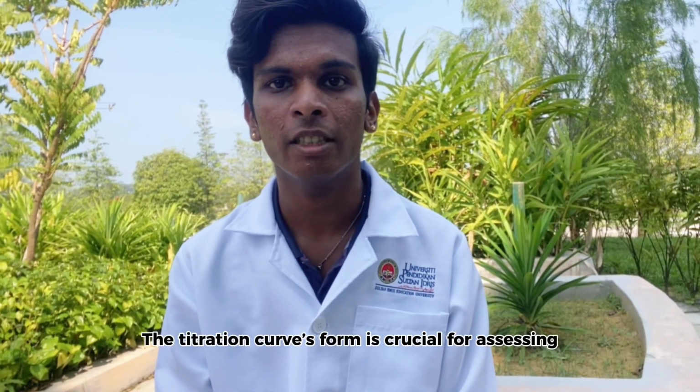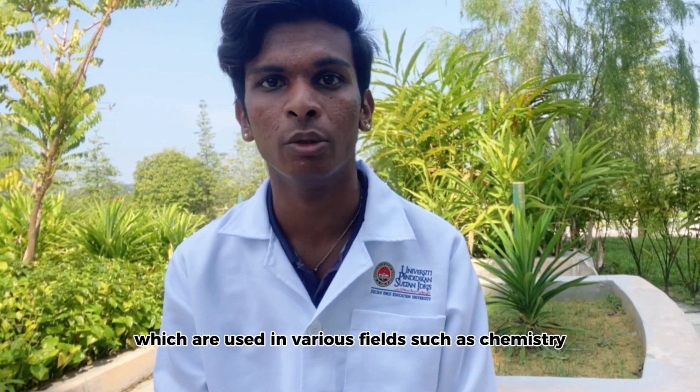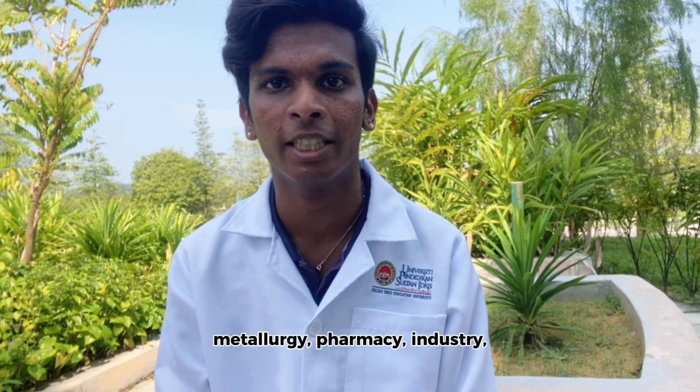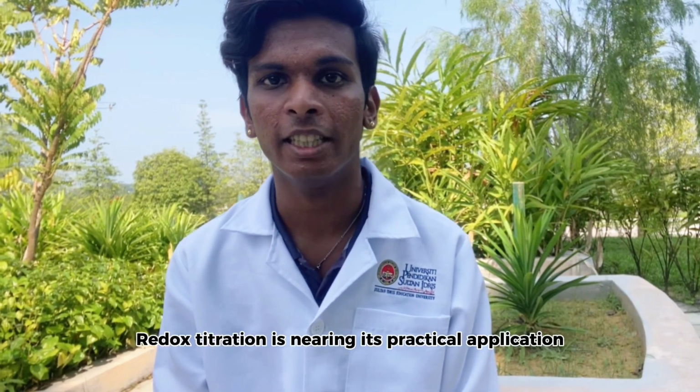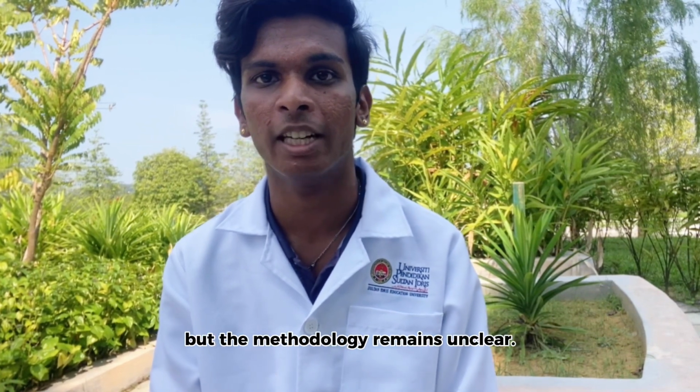The titration curve is crucial for assessing redox titrations, which are used in various fields such as chemistry, metallurgy, pharmacy, industry, food science, public health, and environmental analysis. Redox titration is nearing its practical application, but the methodology remains unclear.